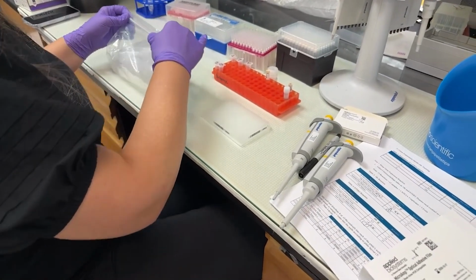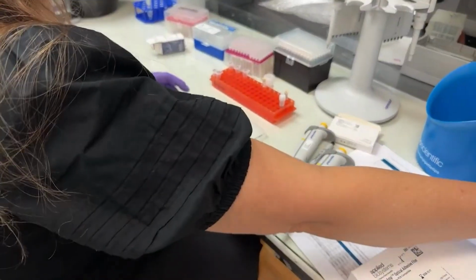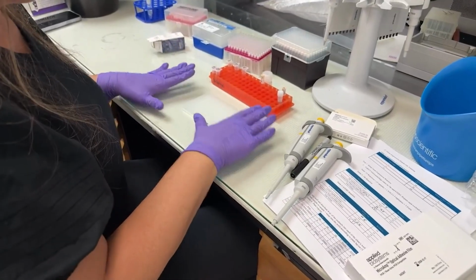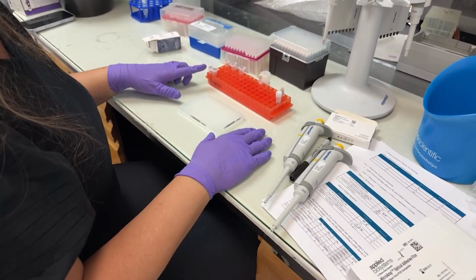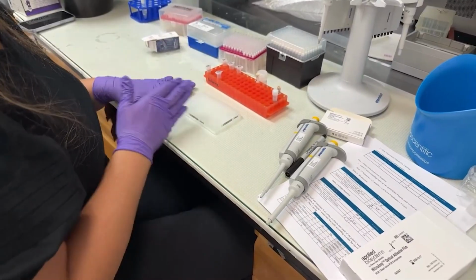But for today and all the instruments in the bio garage, this 384 well plate is what we're going to work with. I've got a map and you'll see it in the follow-up and in my printed protocol, but what I'm going to do is put each of these master mixes on the plate.